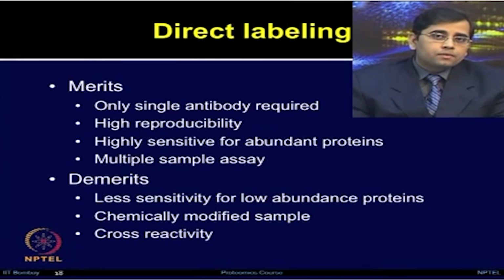However, the direct labeling method has a few disadvantages or demerits. It is less sensitive for very low abundant proteins. Chemically modified samples are used, and there is some chance of cross reactivity.